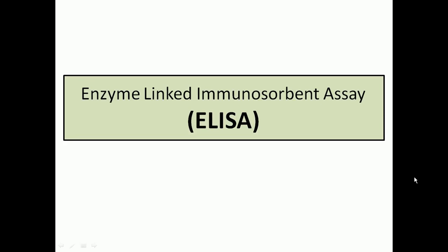Now, the major important thing about ELISA is that it is extremely powerful and extremely sensitive, because ELISA can give us the identification of proteins at the picogram level. So that's why it's really important for all the process. So let's talk about ELISA as an overview.